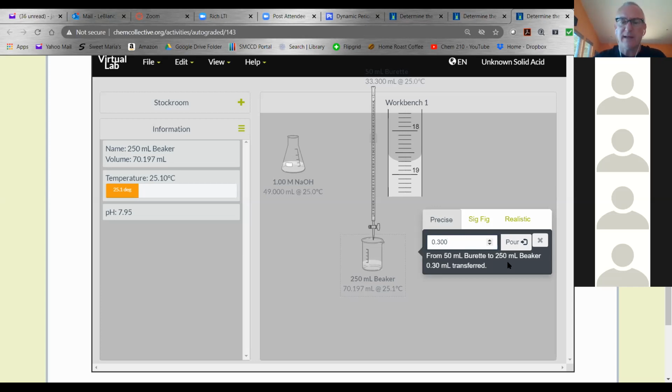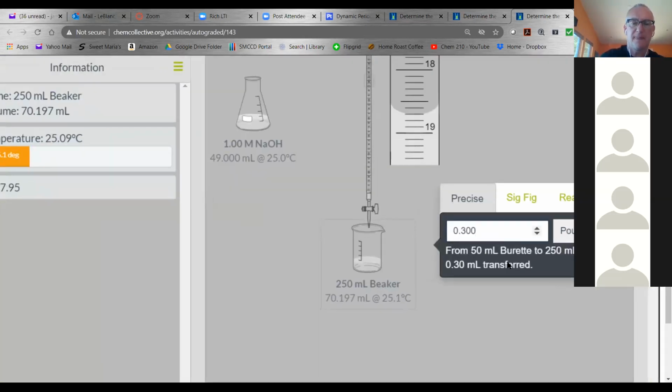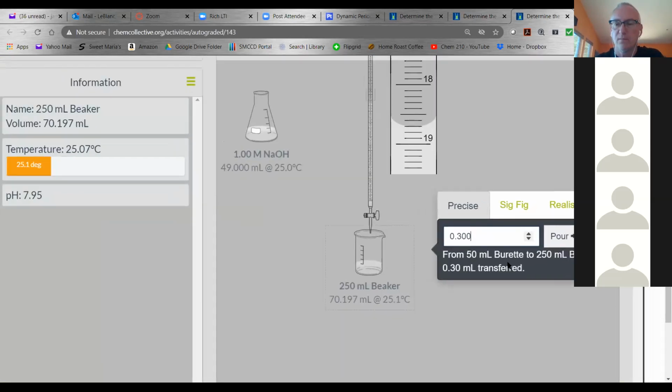So mine, I should zoom in a little bit. Mine is slightly pink, but the pH level is 10.03. Yeah, that's good, because it's going to change big time. I mean, I'm at 8 right now, so I'm going to back off and go to like 0.1, because it's going to change dramatically in a second. Still not pink. Almost.